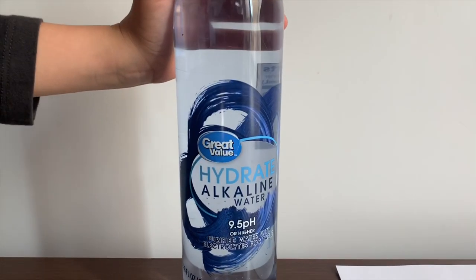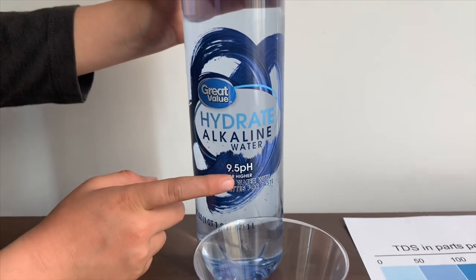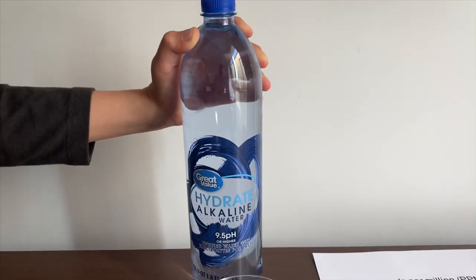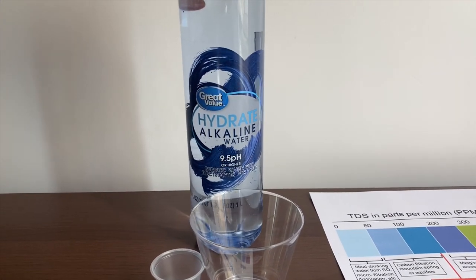This is Great Value Alkaline Water. It says the pH is supposed to be 9.5 or higher. It has electrolytes for taste and it costs 98 cents. It's sourced from Wisconsin and you can buy it from Walmart.